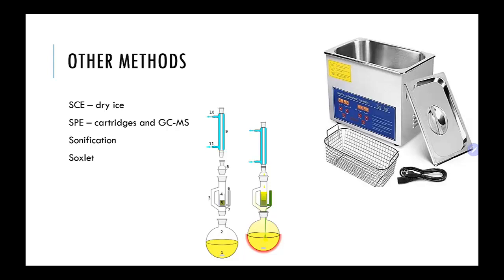You can also do it with microwaves, monowaves, and things like that. Soxhlet apparatuses are the more traditional way of doing these kinds of extractions. It's a little more intensive in terms of length of time, but it's basically taking a reflux, which is boiling the solvent, allowing it to go up into the Soxhlet apparatus. That's what this thing is right here.